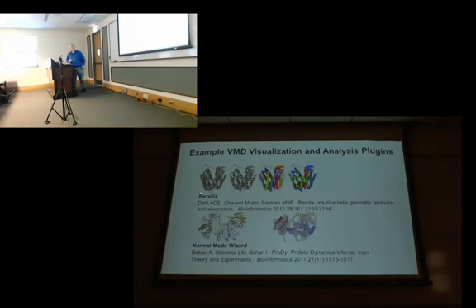Some other examples are Bendix, which does helix analysis and draws some very nice figures. They're easier to understand and produce better looking figures of these helices. And Normal Mode Wizard, which works in concert with the ProDy tool that some of you may already be familiar with.